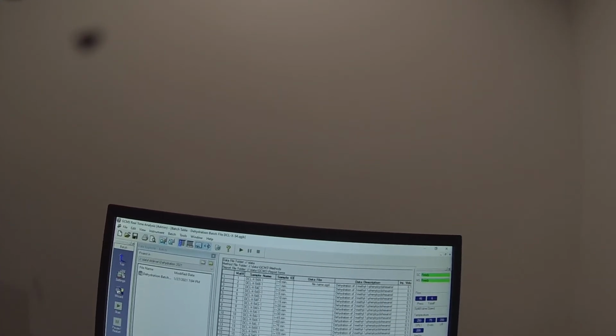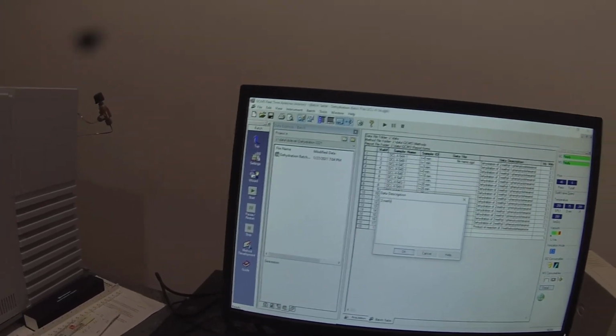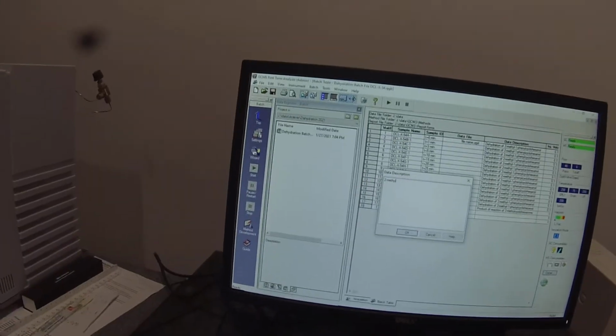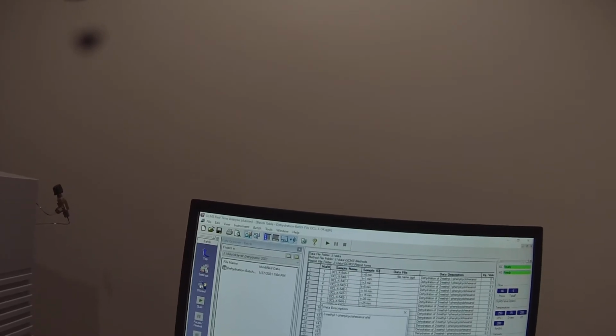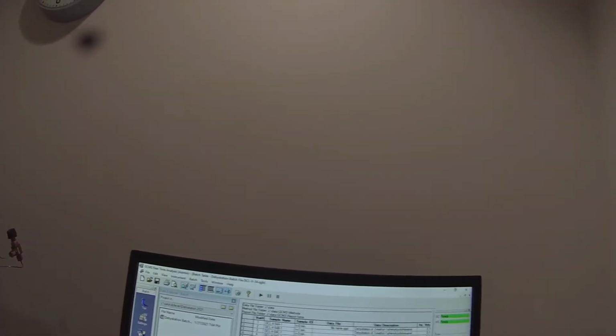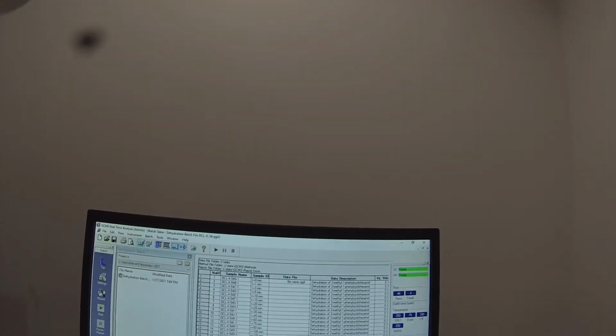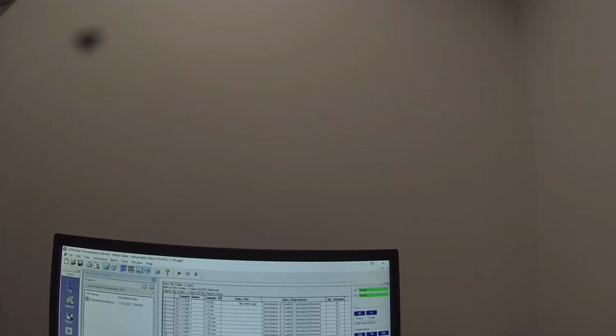And for this one I will put 2-methyl-1-phenyl cyclohexanol after column chromatography. The injection volume in all cases is going to be 0.1 microliters because of the concentration of the sample.